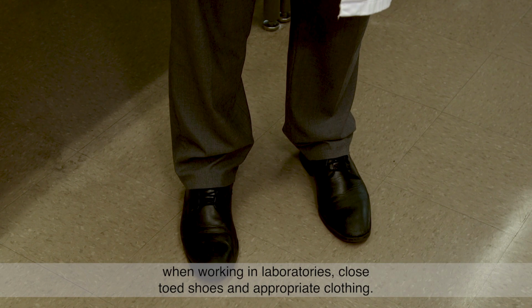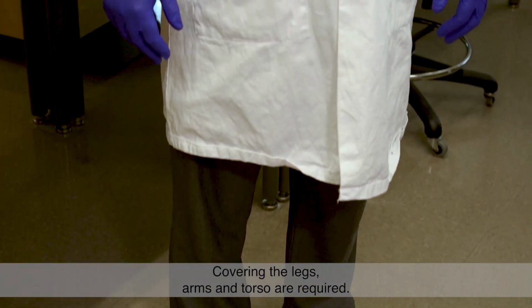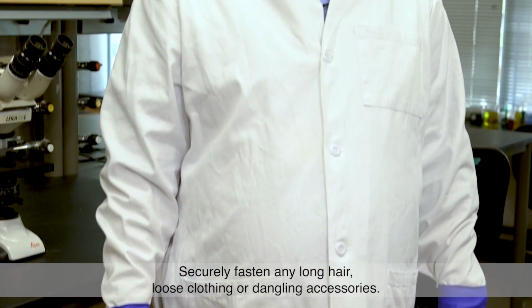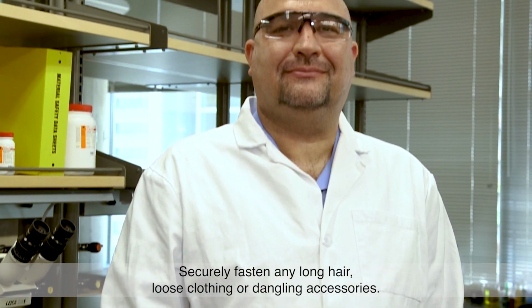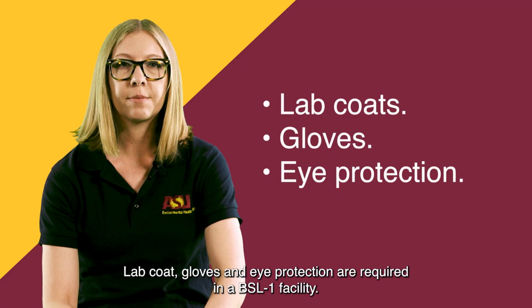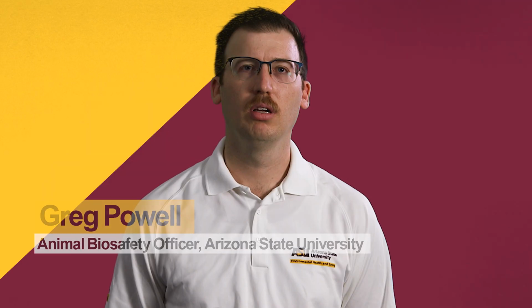When working in laboratories, closed-toed shoes and appropriate clothing covering the legs, arms, and torso are required. Securely fasten any long hair, loose clothing, or dangling accessories. Long nails are not permitted. Lab coat, gloves, and eye protection are required in a BSL-1 facility.